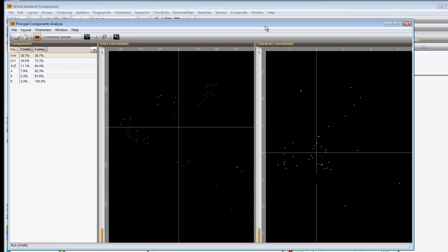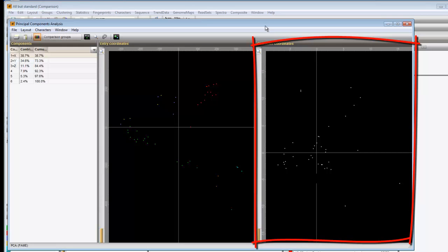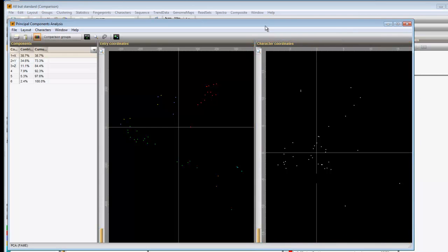The entry coordinates panel shows the entries plotted to the first two components. From the colors we see, we can derive that the three genera are fairly well separated. The character coordinates panel shows the characters plotted in the same diagram. From the character coordinated panel, one can see the contribution each character has to the two displayed components.